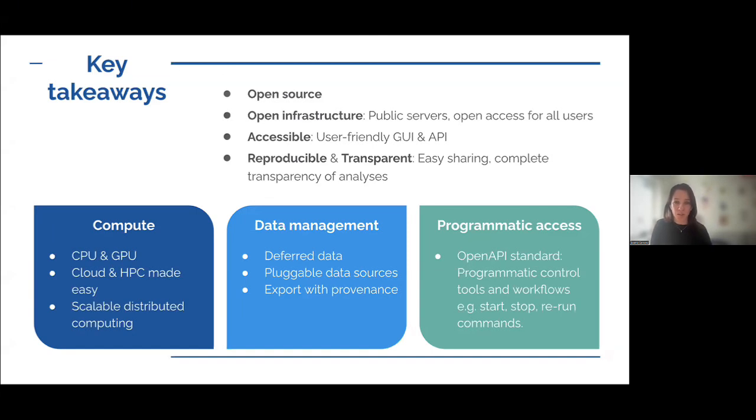There is also open infrastructure. So you have public servers now, and if you don't have the computational resources at your institute to run this analysis, you can use these public ones. So it's open to everybody. You only need an account, a browser, and an internet connection, and that's all you need. That means it's also accessible, and it also has a user-friendly interface that you saw today in different examples.